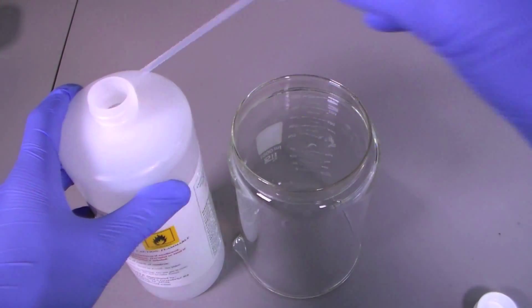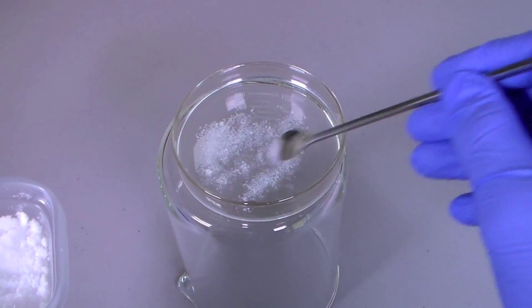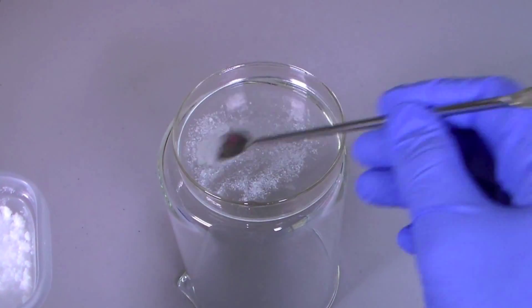Start by adding a few milliliters of methanol to the petri dish and then add a small amount of boric acid. Mix well until most of the acid is dissolved.